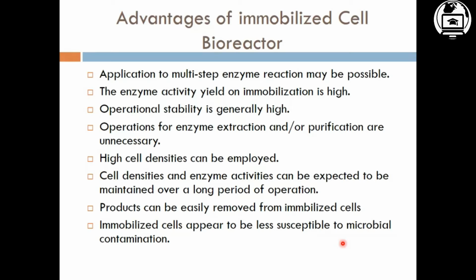Products can be easily removed from the immobilized cell. Immobilized cells appear to be less susceptible to microbial contamination.